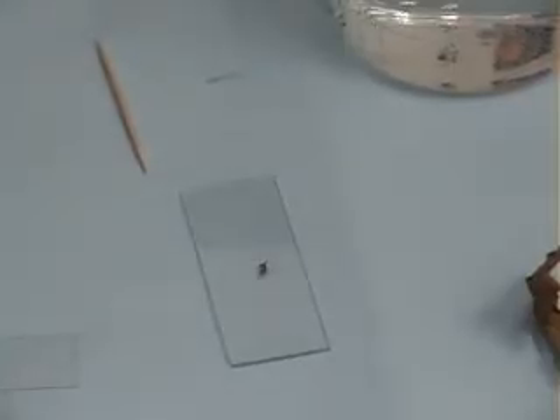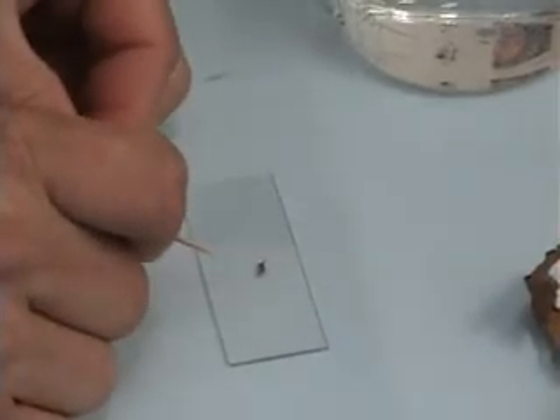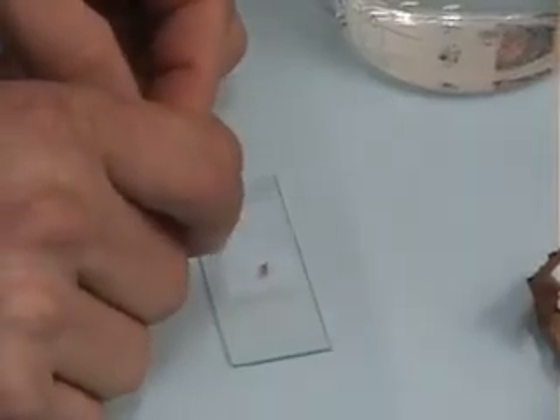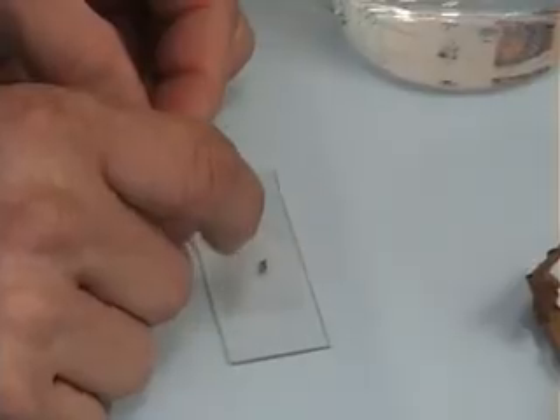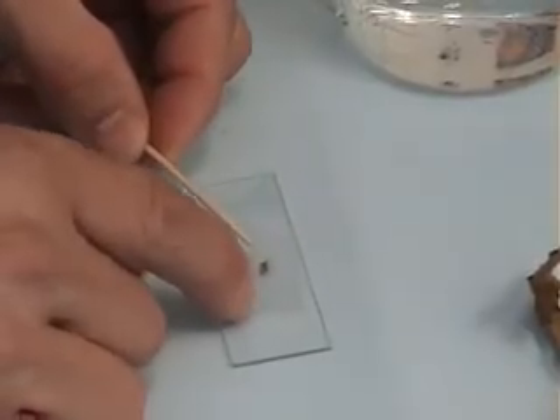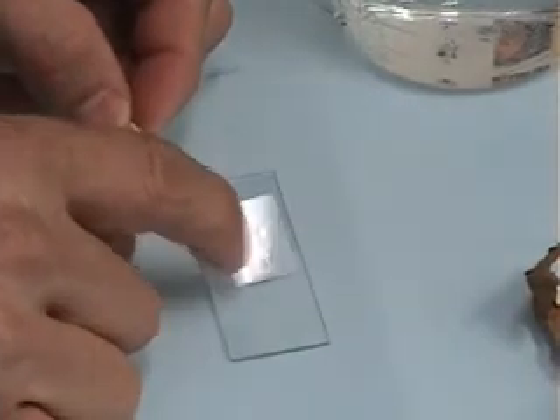Then, once you have your specimen in the drop of water, you would take your cover slip and your toothpick. Place your cover slip at a 45-degree angle on one side of your water drop, making sure not to touch the water. Then slowly slide the cover slip up, using your other finger to help you, until it touches the edge of the water. As soon as it touches the edge of the water, you drop your cover slip. This ensures you have no air bubbles.